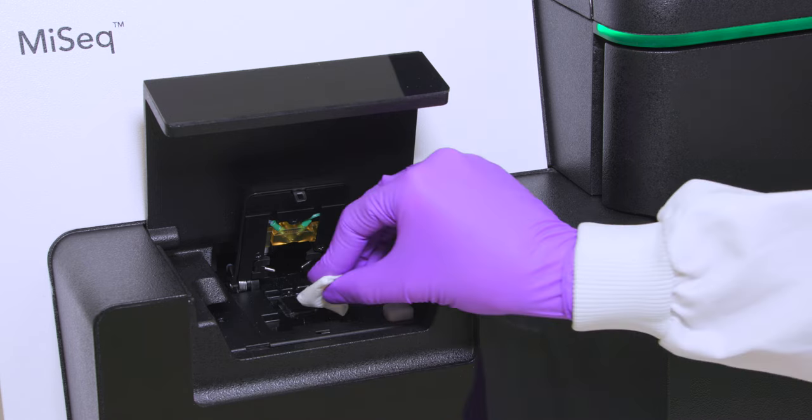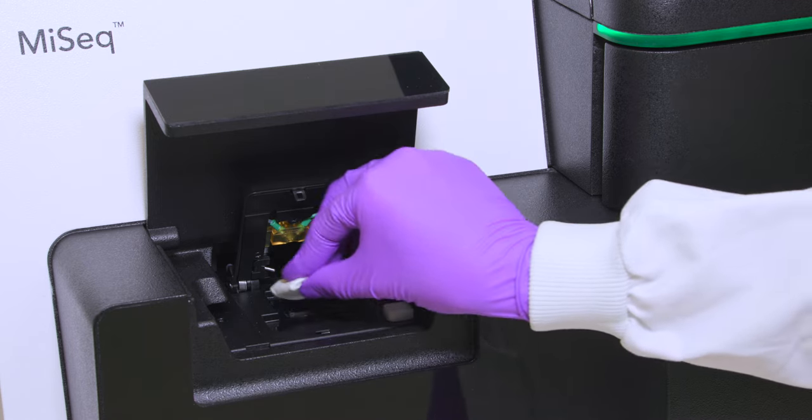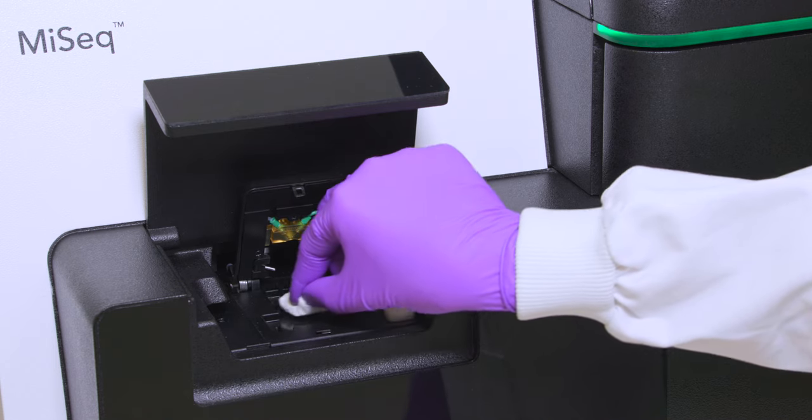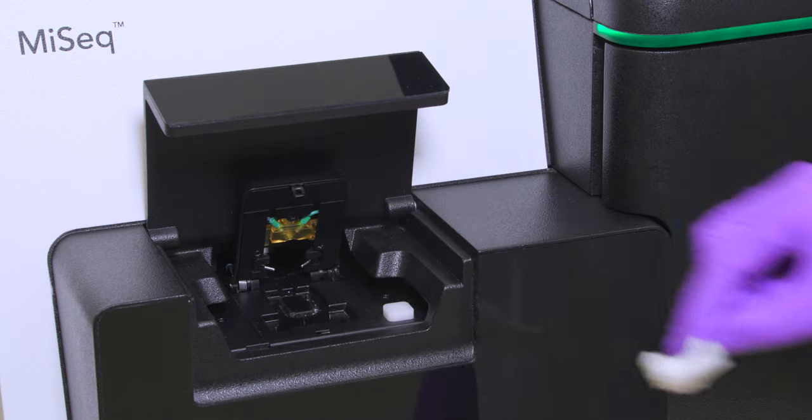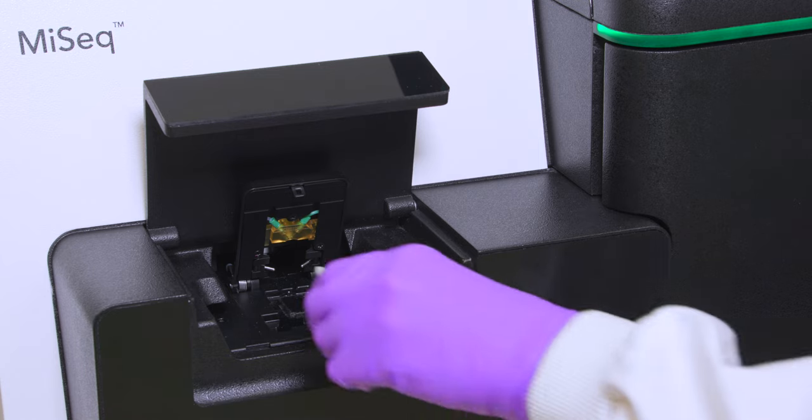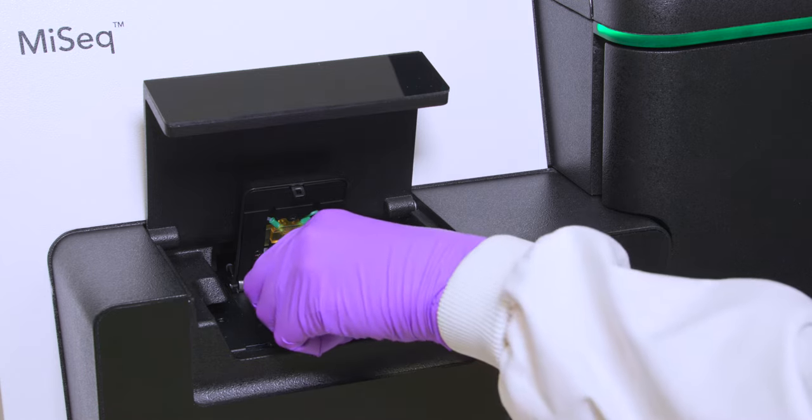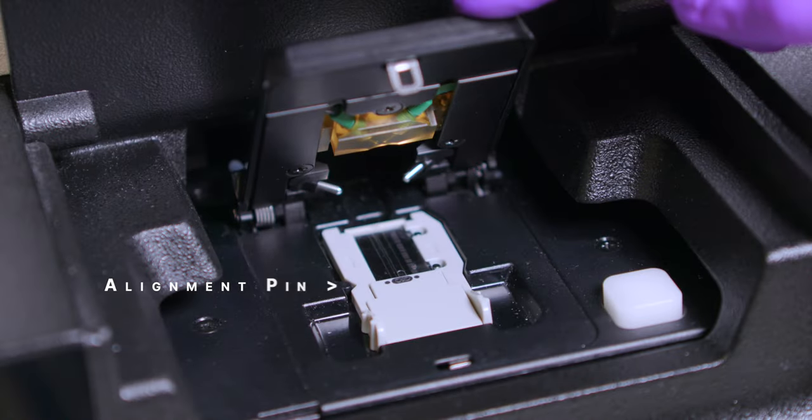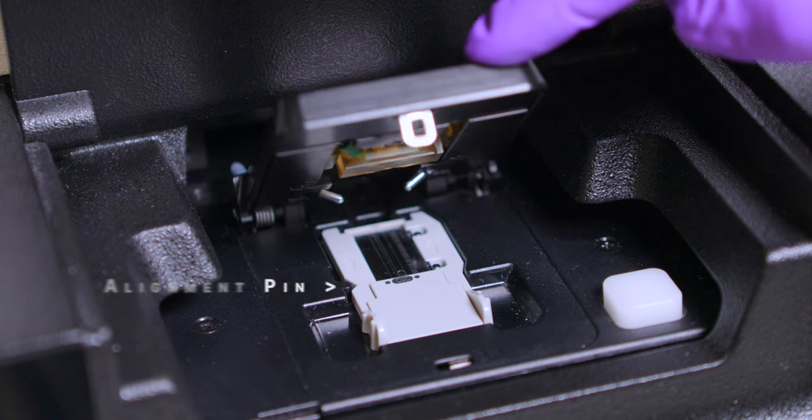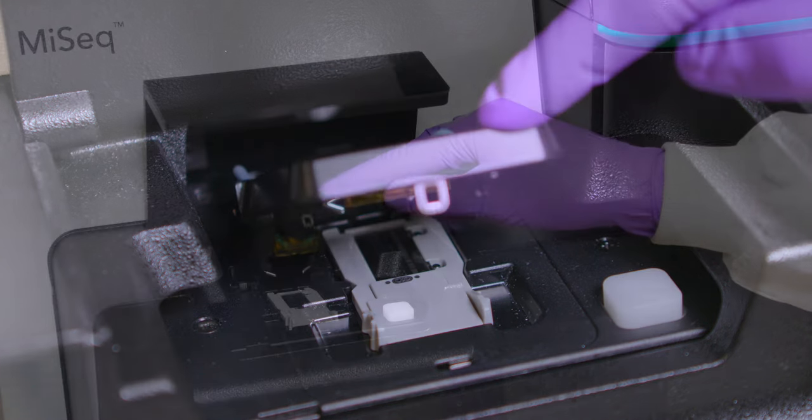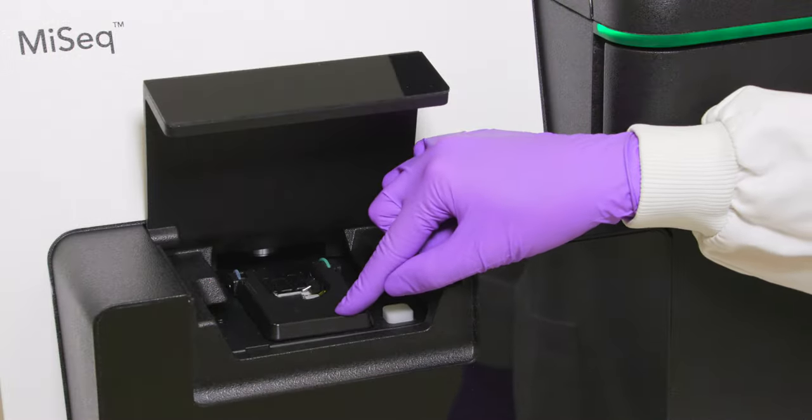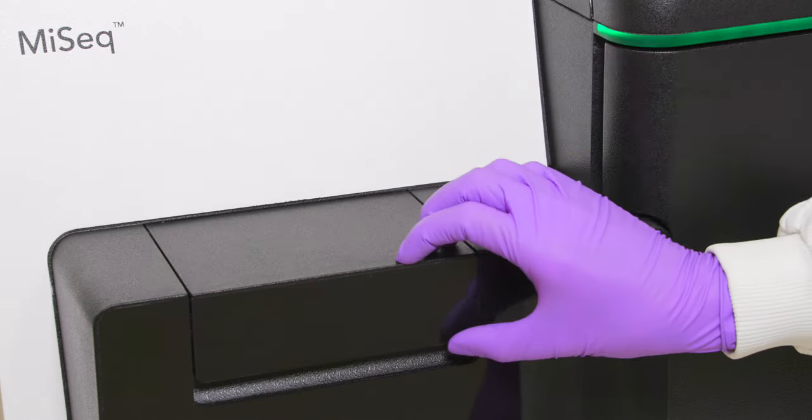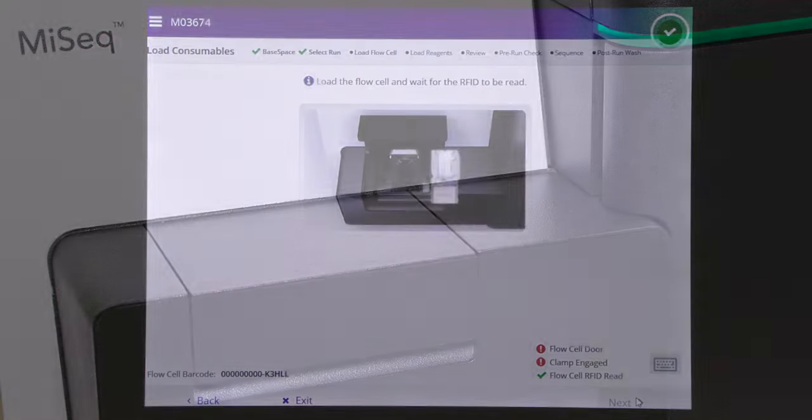Carefully wipe the surface of the flow cell stage until it is clean and dry. Holding the flow cell by the edges, place it on the flow cell stage. Gently press down on the flow cell clamp to close it over the flow cell. The alignment pins will position the flow cell. An audible click indicates that the flow cell clamp is secure. Close the flow cell compartment door.